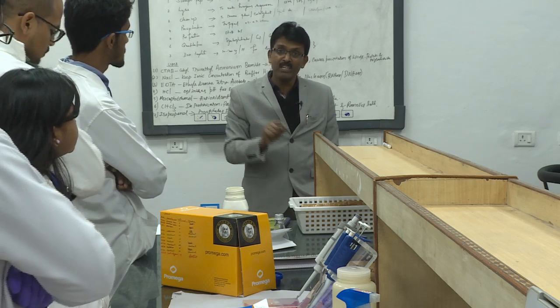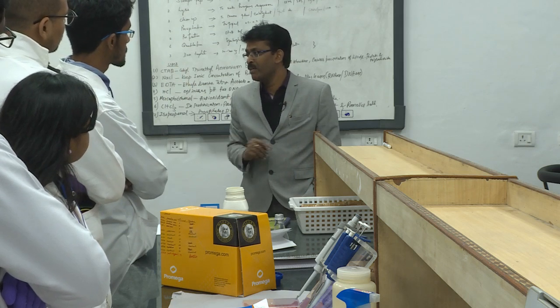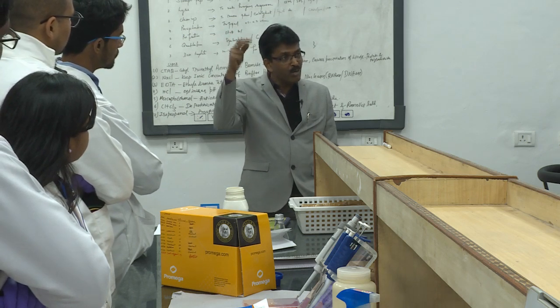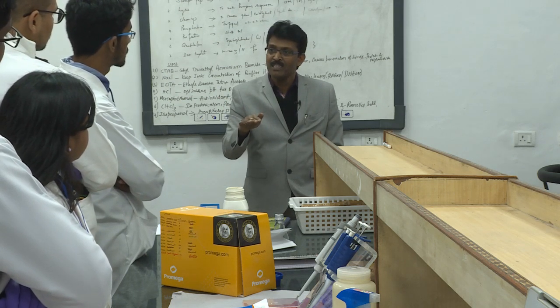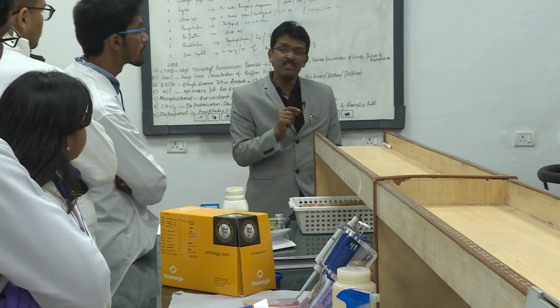Okay? Even if you are making multiple preservations, multiple tubes, normally in our laboratory we go for 4 different tubes. All the 4 tubes should come from the same colony, right? So, all of them are genetically uniform, genetically identical. This is one of the most important criteria you have to adopt in your experiments.